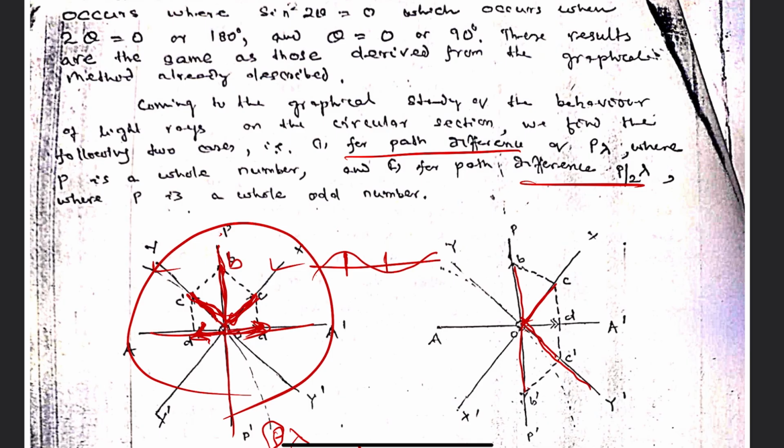and when they enter into the analyzer, they are split up into OD, both. The other part is eliminated. So both move in the same direction, their amplitudes add up, and the resultant amplitude comes into the picture.